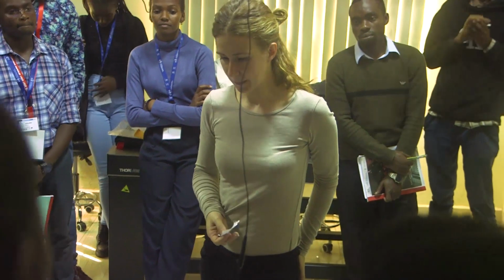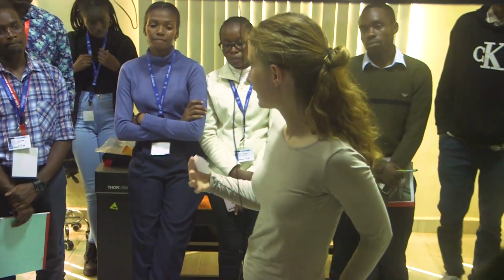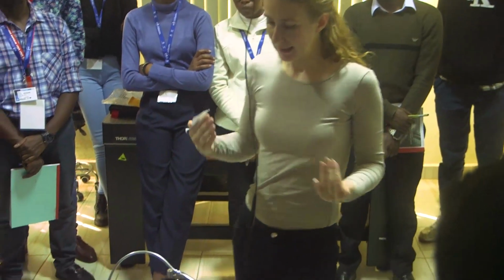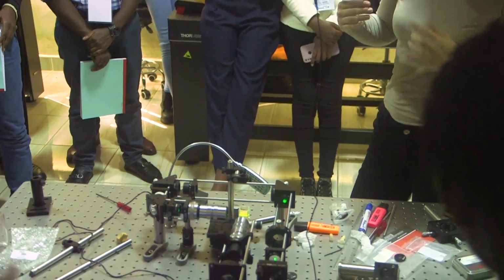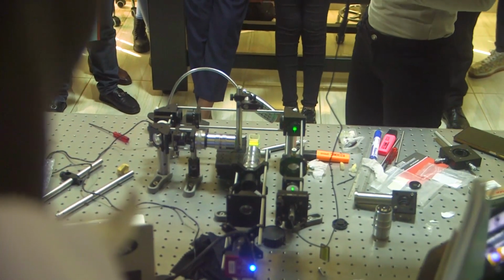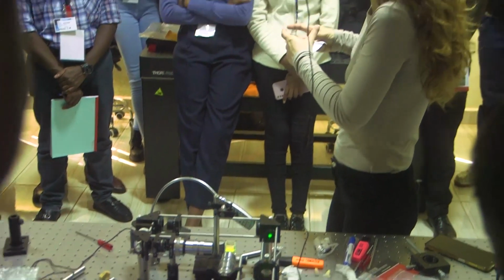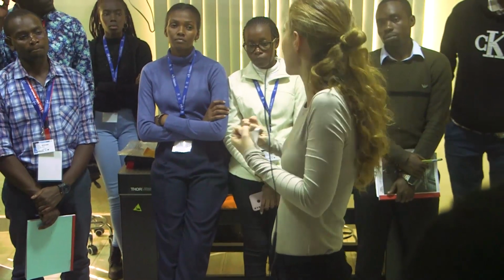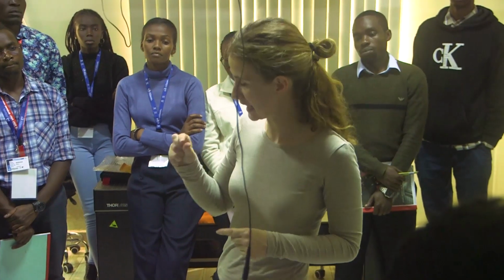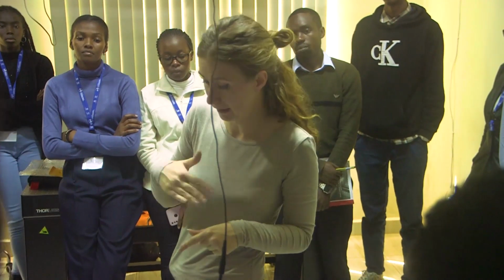With light sheet, something that you want is to be able to control the dimension of your beam. The reason is that, I don't know if you remember, but I mentioned that it is important to control the thickness of the light sheet, because if you have a light sheet that is thick, then you will excite the fluorescence from a thick layer. So you don't have a good axial resolution. But if the light sheet is thick, you have a long Rayleigh length, which means that your light sheet will be homogeneous in space.